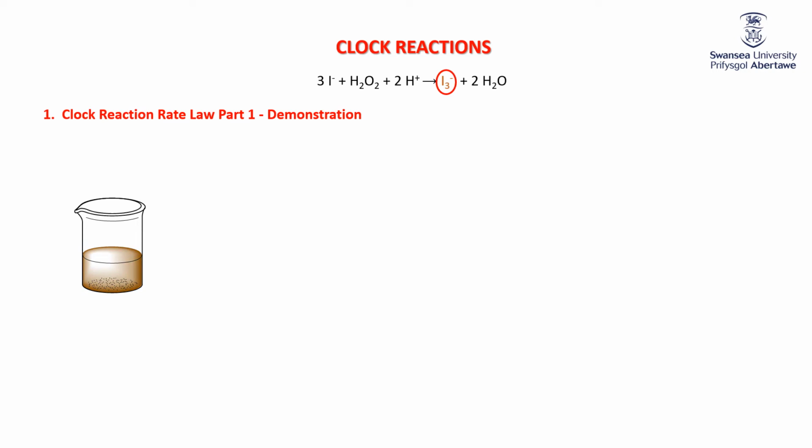Now you're told in your A-levels that you can follow chemical reactions in order to determine the rate by seeing what happens to various factors associated with the reaction as you go through. So pH is one of those. You can have a mass change if there's a gas involved. You can have a volume change if there's a gas involved. And of course, one of the cute ones is color. And that's exactly what we can do here. We start off at colorless and we end up with this orangey brown solution.